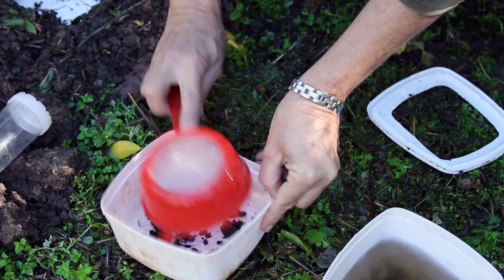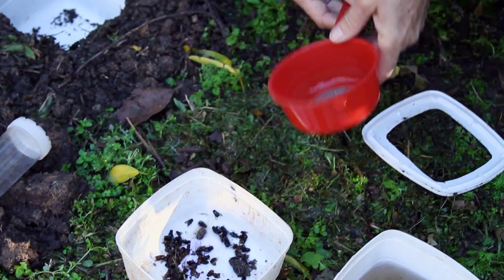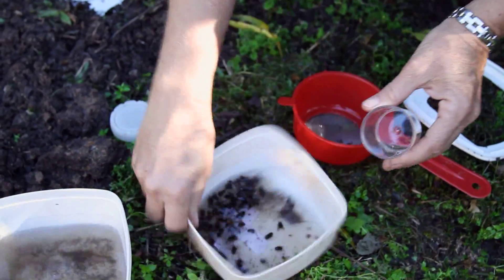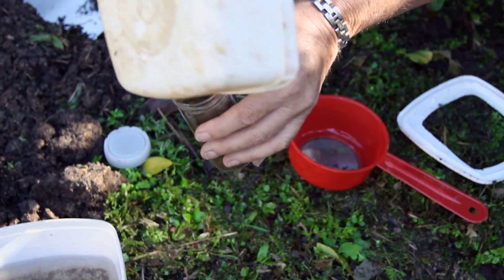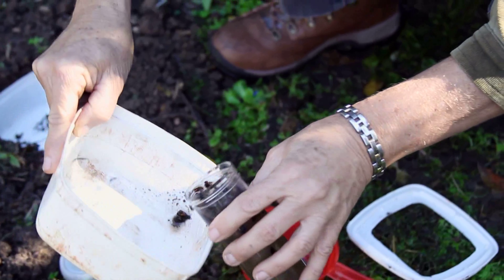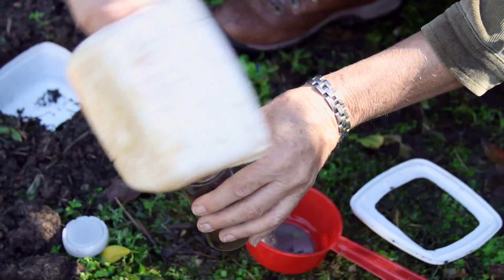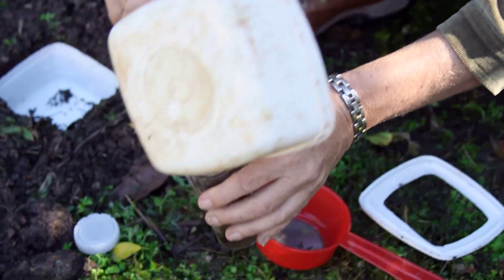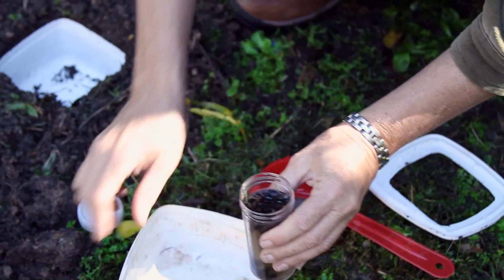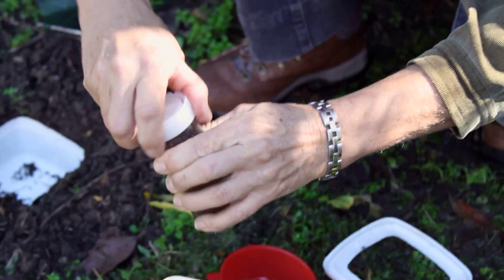Bang your sample back into a container. Add preservative and put your sample back into a vial. Get all of the sample, even the bits of dirt, because there may be very small invertebrates caught in there. There you have a sample — it should have two labels in it: the day you set it up and the day that you take it out.